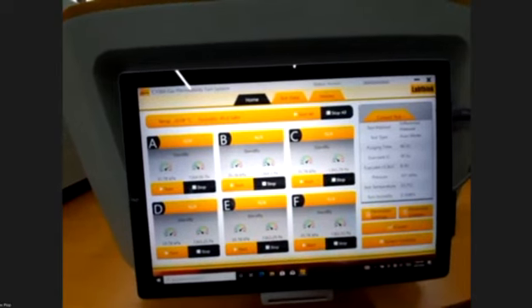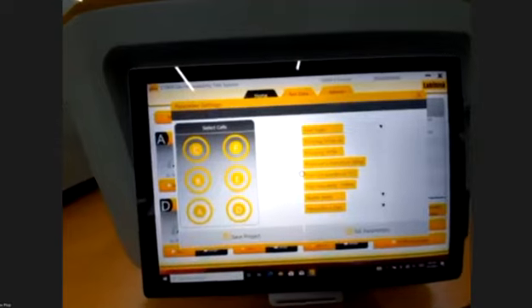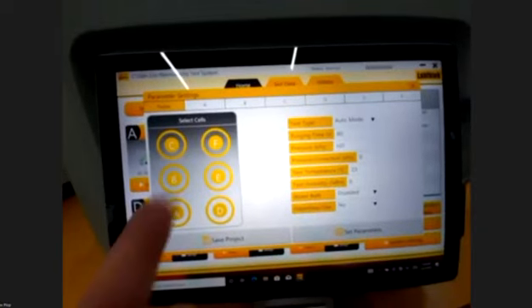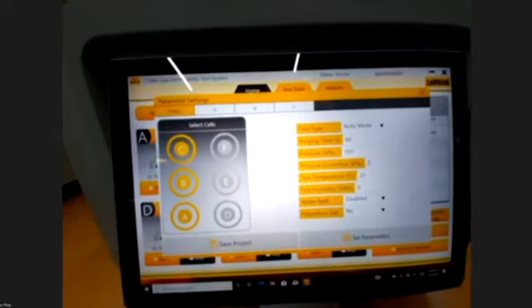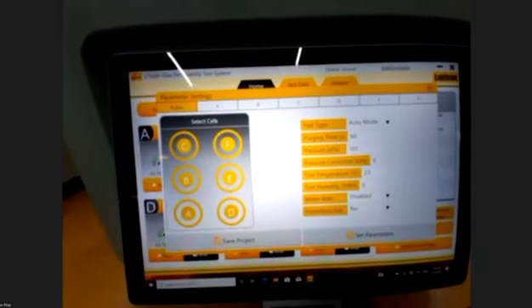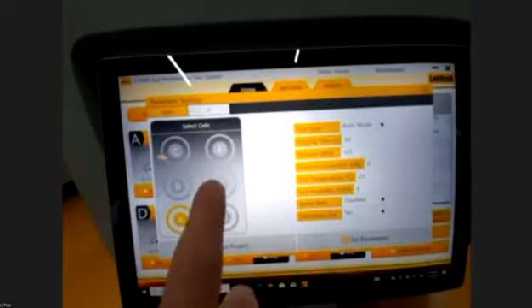To start my test, after I prepared my samples, I quickly come to parameter settings. An important feature of the tester would be that I can actually deactivate some of the cells, and I could only work with the 3 from the left. So we have the freedom of also using just one cell, for example, or we can use all of them.